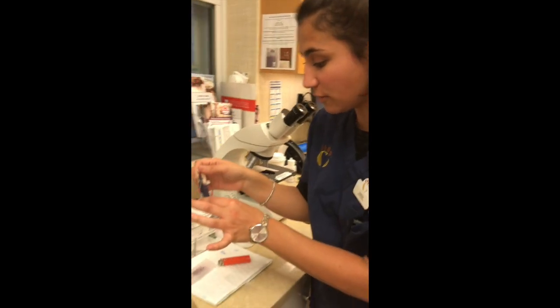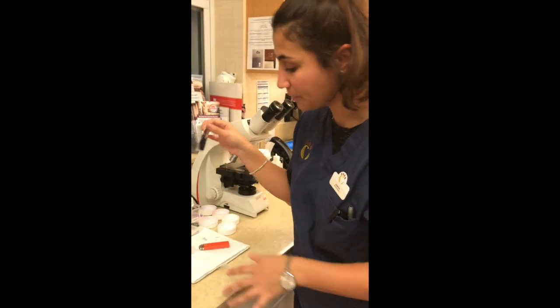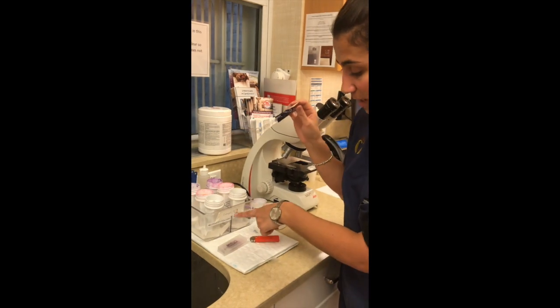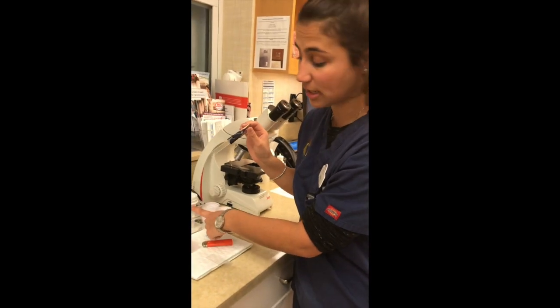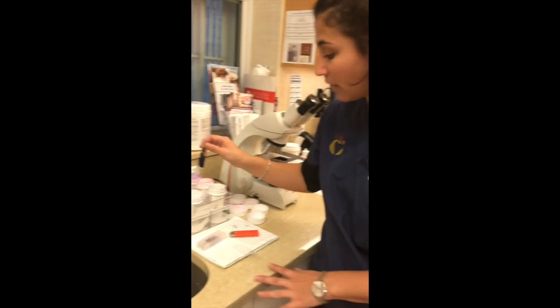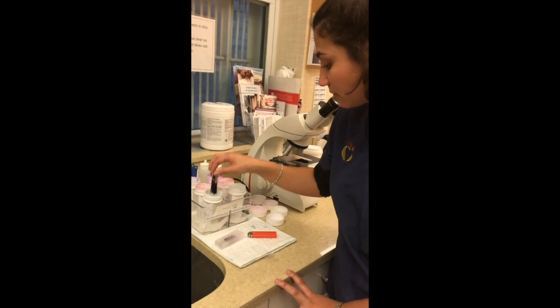Okay, so now we're going to stain our vaginal cytology just to determine what stage of estrus our dog is in. The first step I'm going to do, I obviously have a clip, and we're going to keep it frosted side up so I know which side is up and down. Starting with the first stain, which we're going to do only in our blood cytology stains, not our ear cytology stains, because we don't want to get the bacteria mixed up. 5 to 10 dips in each stain.